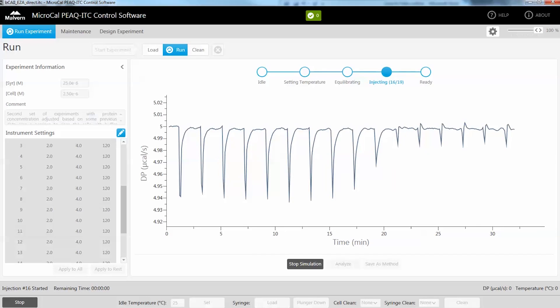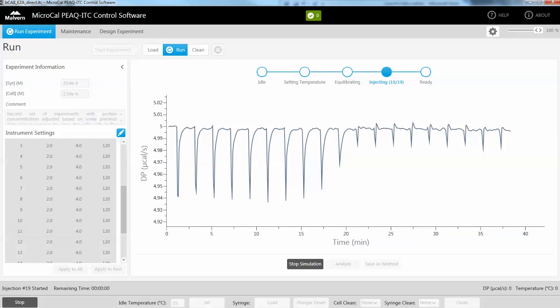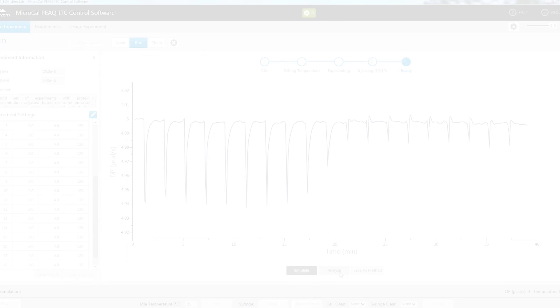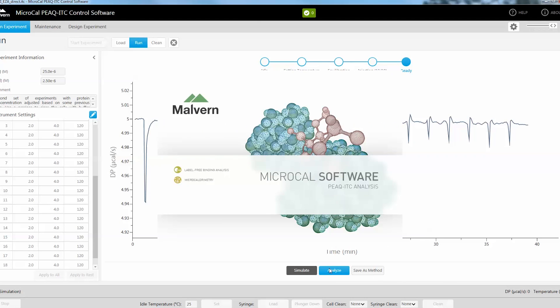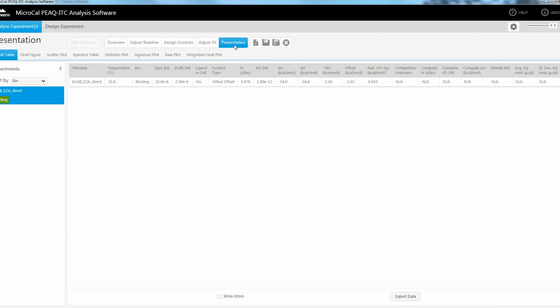When in the software the status icons at the top provide clear indication that an experiment is running. Upon completion the analysis button becomes enabled which in turn will launch the MicroCal Peak ITC analysis software with the current experiment analyzed.